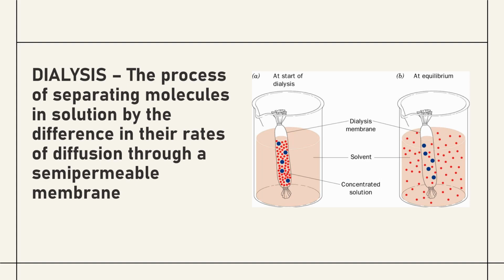And then after that, we tested for the contents present in the cellophane and present in the dialysate. Okay, and so but then before that, let's take a look at the application of dialysis. In chemistry and medicine in general, dialysis is utilized as a separation technique for removing unwanted compounds from macromolecules. This one is important in removing impurities like in drugs. This one is a crude separation technique.